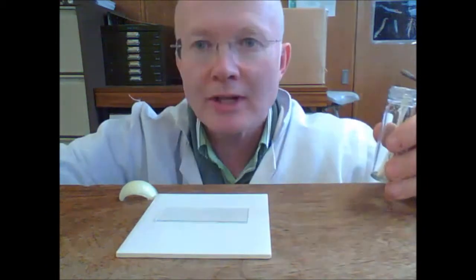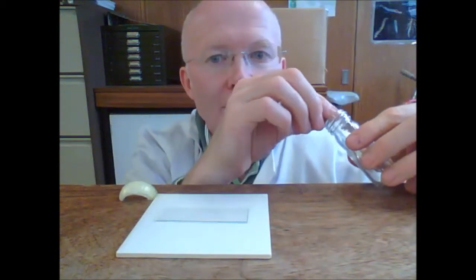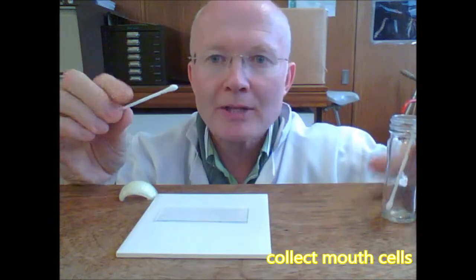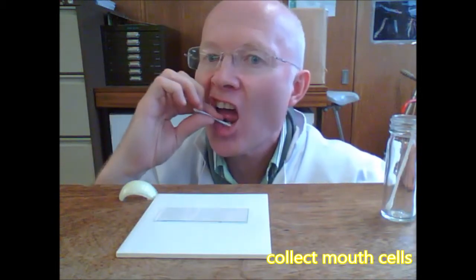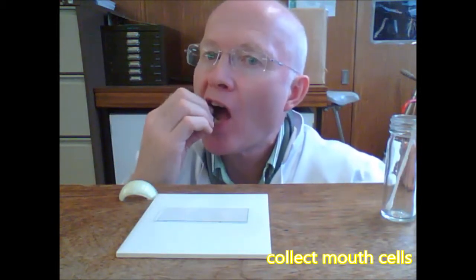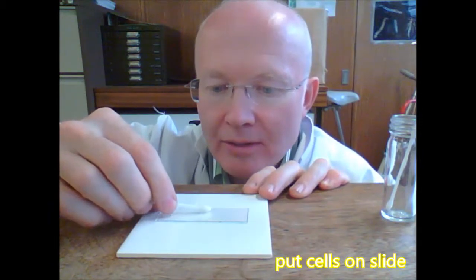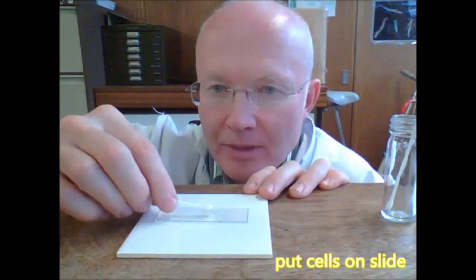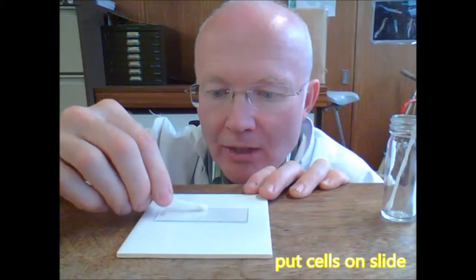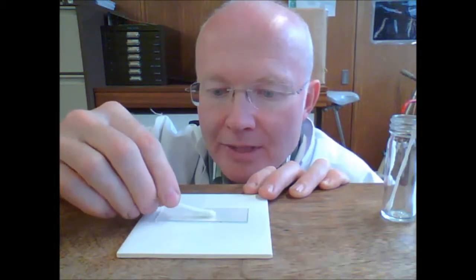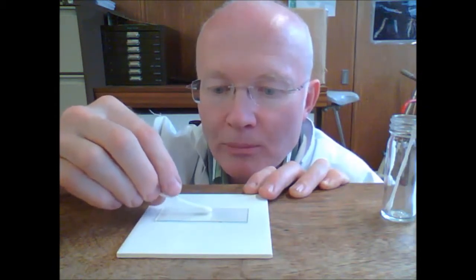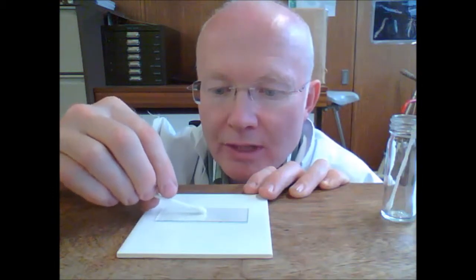Okay, to examine cheek cells of the microscope, you take a cotton bud. Once you've rubbed it around your mouth, gently print it onto your slide, and then just turn it as you go in the middle of the slide, and you'll print some of your cells onto the slide.